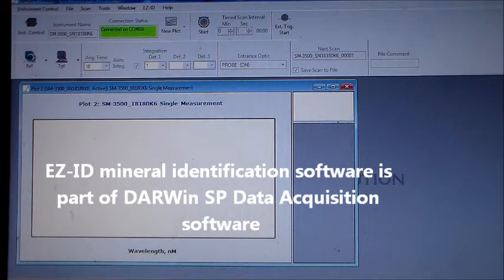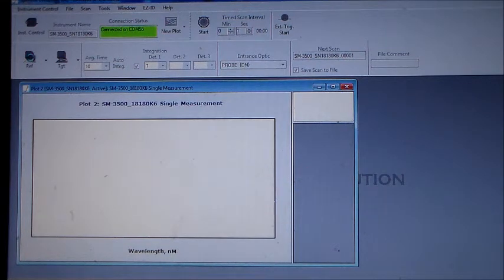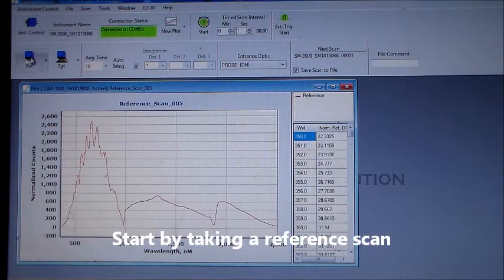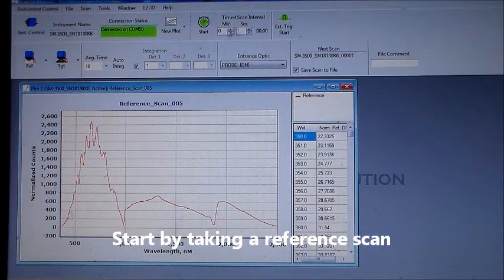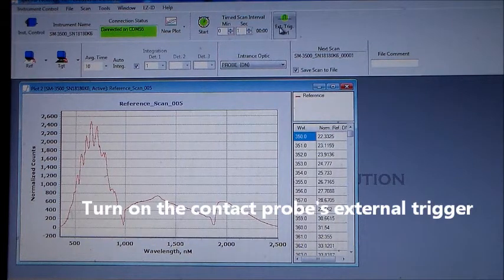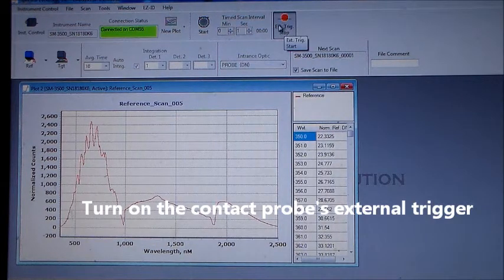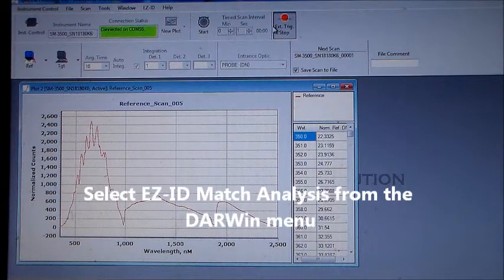Once connected to a spectrometer, begin by taking a reference scan. Turn on the external trigger of the attached contact probe, then select EZID Match Analysis from Darwin's menu.